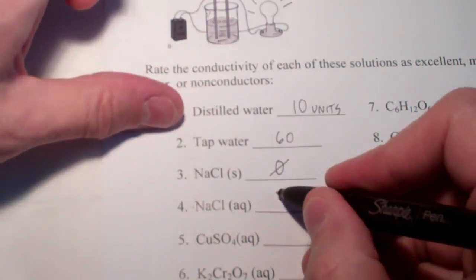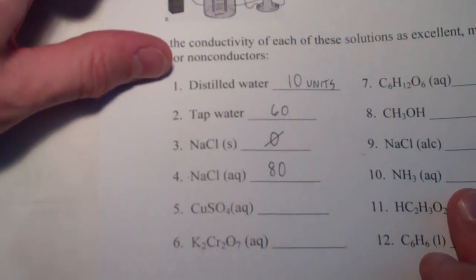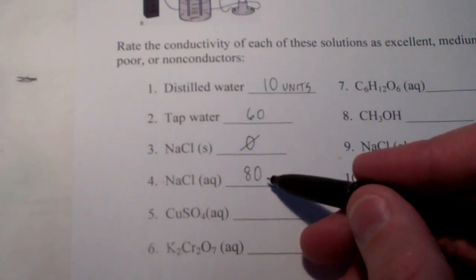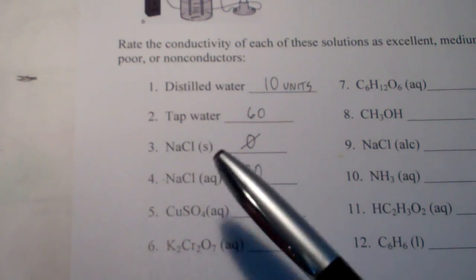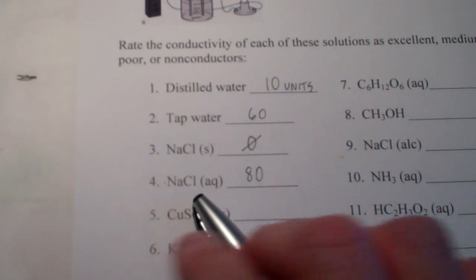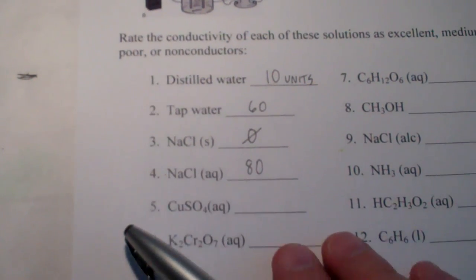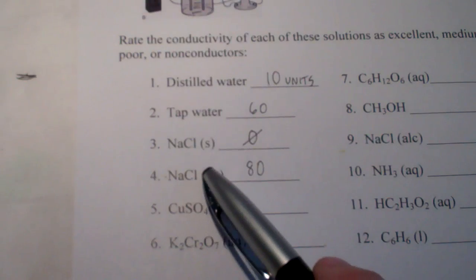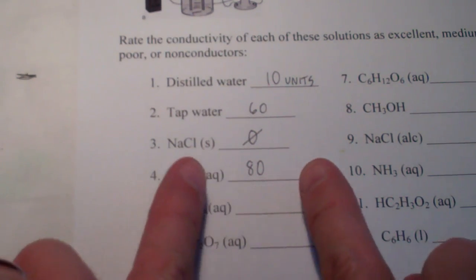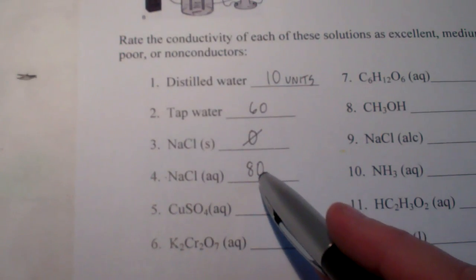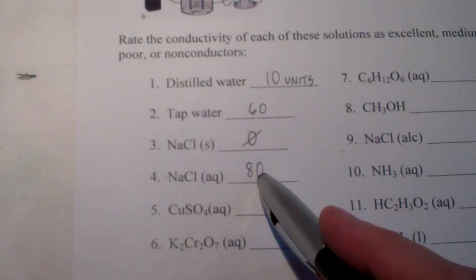So, 80 units for sodium chloride dissolved in water. So, there's something in there that conducts even better than tap water. Now, think about that when sodium chloride dissolves in water from our earlier chapter. Remember that water molecules can surround the sodium and the chloride ions and pull them away from each other. So, we have ions in solution there, and I wonder if that might be the cause of our conductivity.